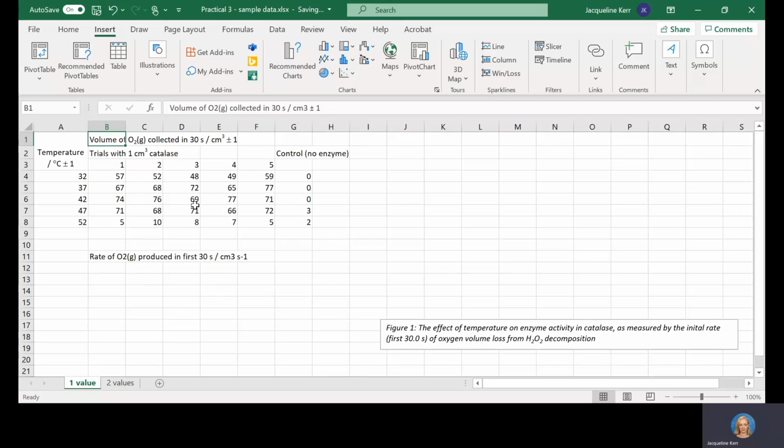Here, this is one where I'm saying, for example, we tested catalase with hydrogen peroxide and saw oxygen given off, and you might have collected that as a volume. So say it was the setup where you put the flask with the delivery tube underwater and you had a measuring cylinder filled with water, and then the volume of oxygen gas that displaced the water could be measured off.